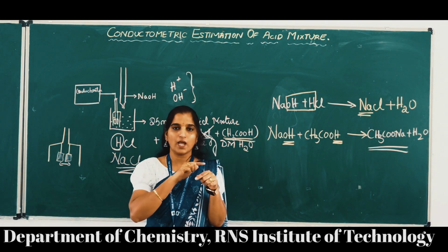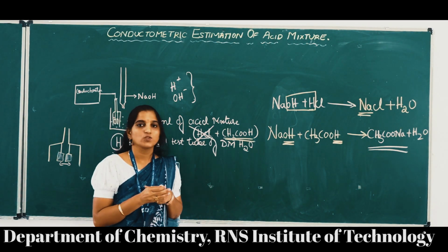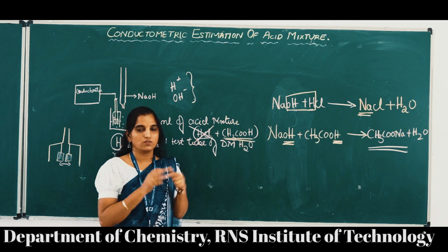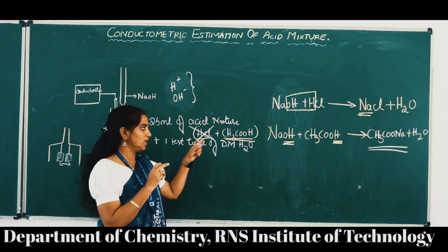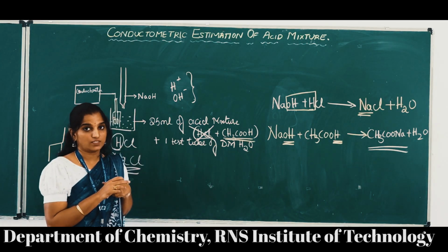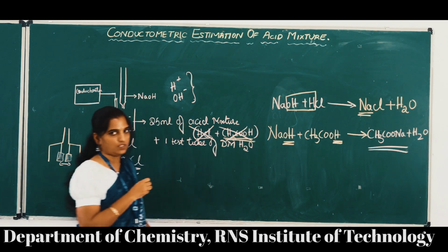Not too sharp, a slight increase in the conductance. This is because of sodium acetate. Sodium acetate is a good electrolyte. So this slight increase in the conductance continues till the neutralization of acetic acid. After some point, even the acetic acid will also be neutralized.